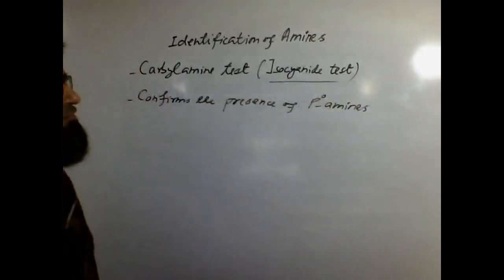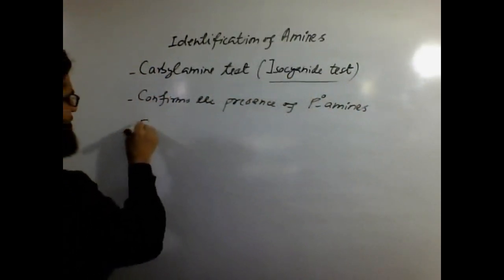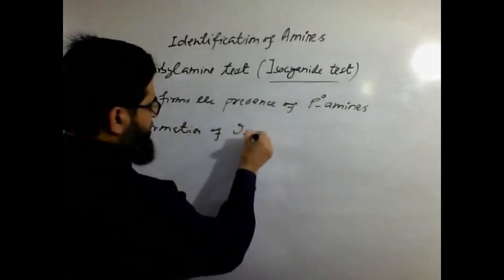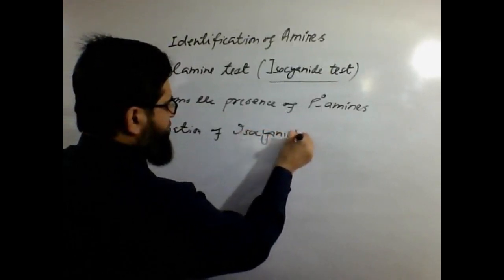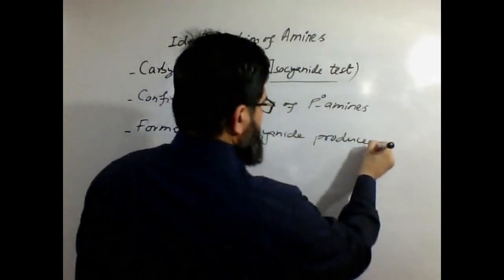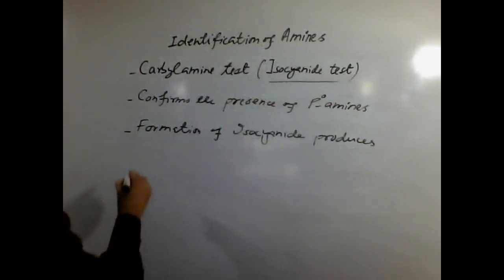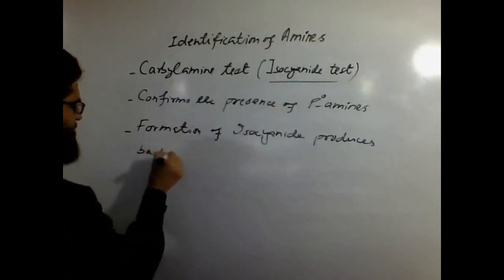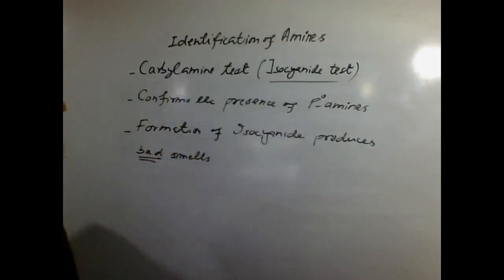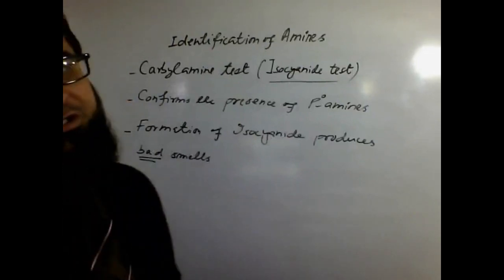The formation of isocyanides produces bad, obnoxious, foul smells.